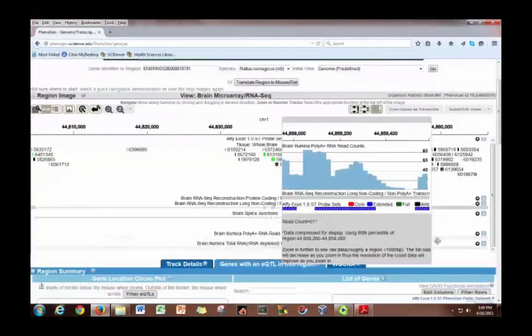And so now what this one is showing you is this first track is our Affymetrix exon probe sets. Just like I said, they've got 1 million, so they got a ton out here. And they're color-coded to match their detection above background. So that's what the DABG stands for. So these that are bright green mean they're actually detected. These that are black means no expression was really detected there. And so it seems to make sense. We're getting them, for the most part, on our exons.